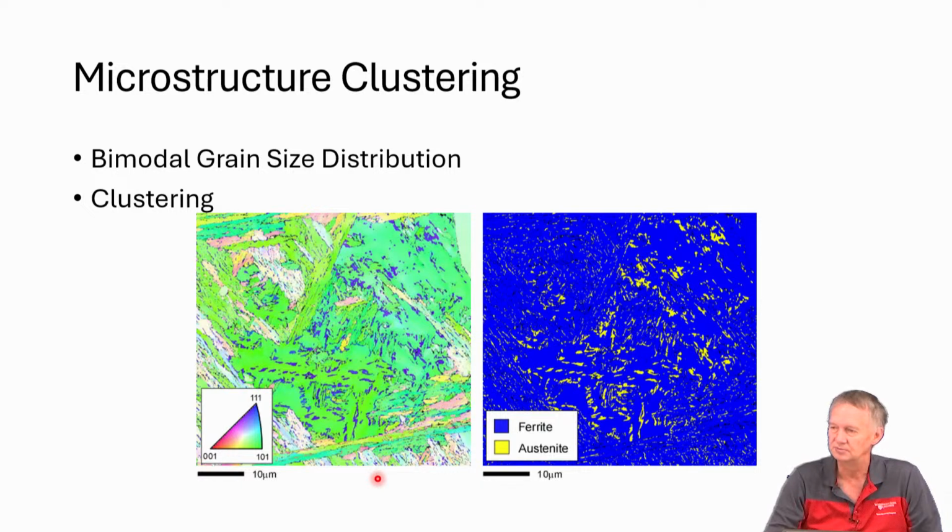Maybe because sometimes the retained austenites are thinner, as you have shown, and there is an interaction volume, and then bands from both grains come together, and that makes the CI low, and then it indexes most of the time as ferrite, maybe, and that's why maybe not.